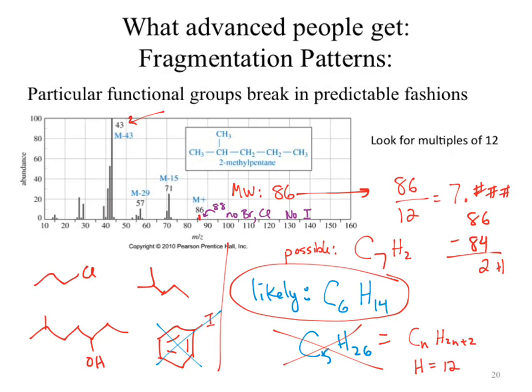It is referred to as your fragmentation pattern. Okay. There are some kind of neat patterns that come out of that. It's not worth spending more time than what we've just talked about. So, I mean, we don't need to do anything. You don't need to do anything with it.